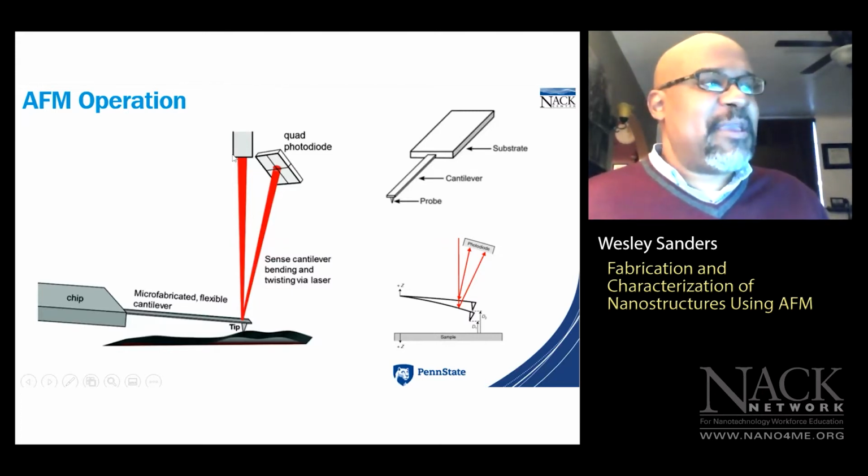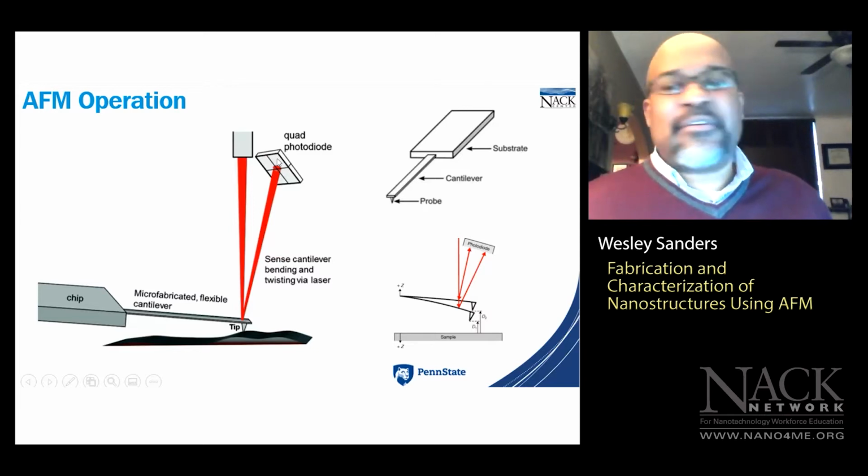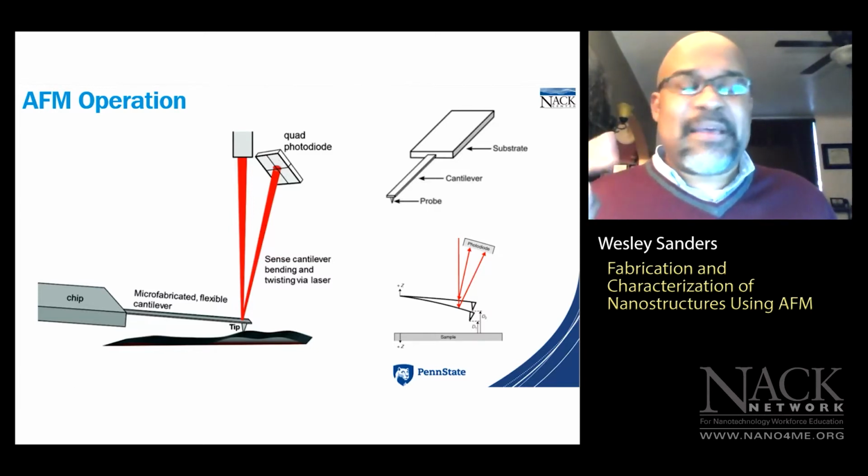So we have a laser beam that's aimed at the back of the cantilever, and the cantilever is coated with a reflective material that allows the laser beam to be reflected and directed to a four-quadrant photodetector that generates an analog voltage that's proportional to the tip motion.